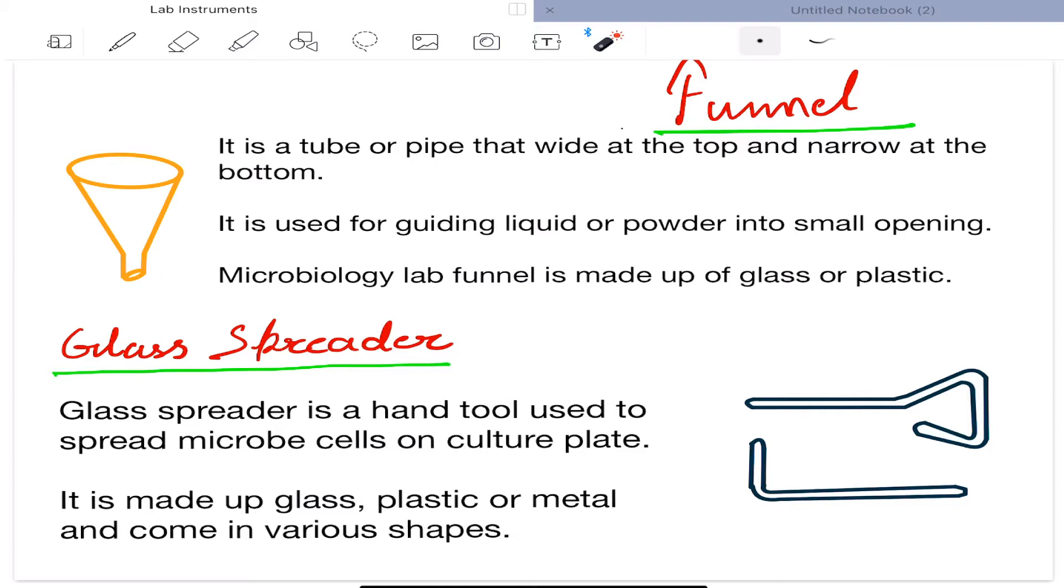Microbiology lab funnel is made up of glass or plastic. Next is glass spreader. Glass spreader is a hand tool used to spread microbe cells on culture plate. It is made up of glass, plastic, or metal and comes in various shapes.